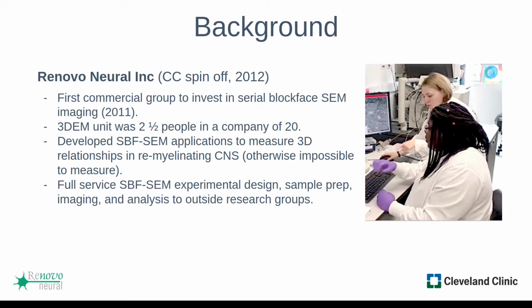Also, Renovo's focus wasn't 3D EM, although that's what many people ended up knowing it for. We were originally intended to be a small asset to the company to add on to their existing myelin and axonal assays. Our goal was to obtain measurements that couldn't be easily obtained in any other way, which I will show an example of a few slides from now, about how we used this technology to measure 3D relationships in remyelinating central nervous system that otherwise would have been impossible to obtain. And that is a strength of this technology for other areas as well.